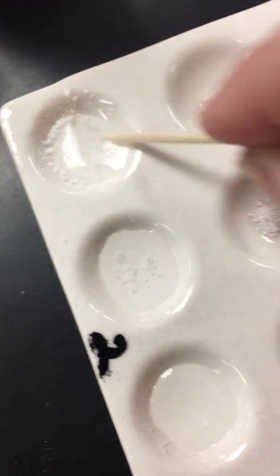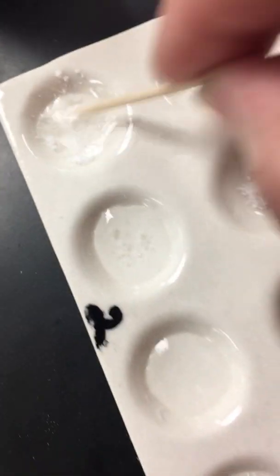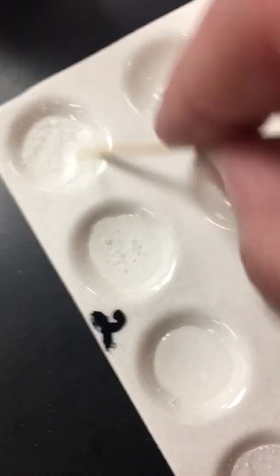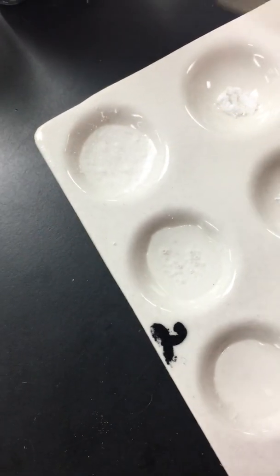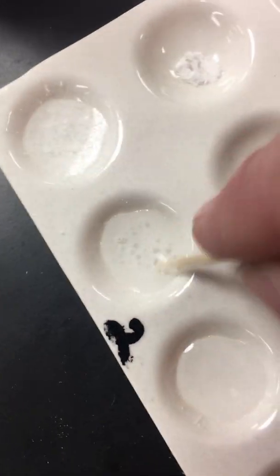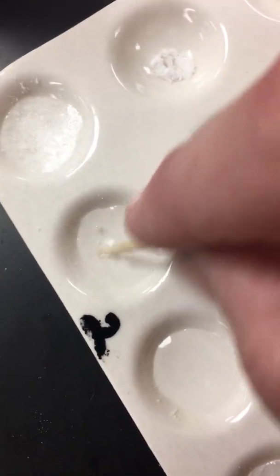So this is aspirin. Here's the reaction, or really not really too much. It's dissolving a little bit, but not real well. This is the Alka-Seltzer, and it bubbled and it disappeared.